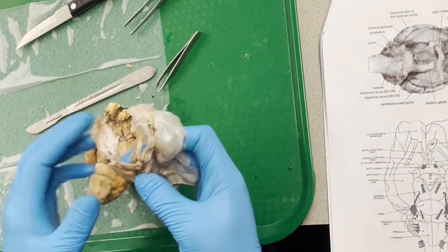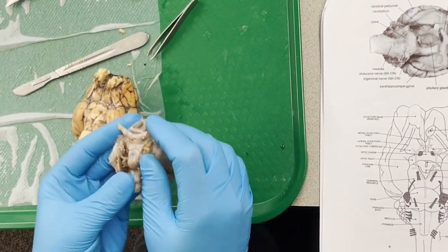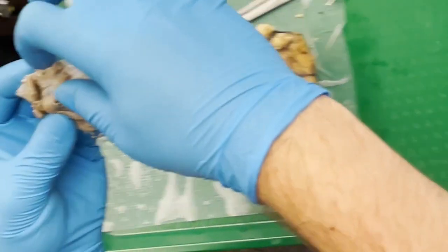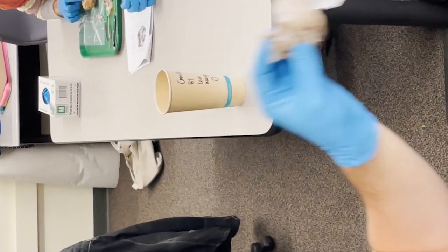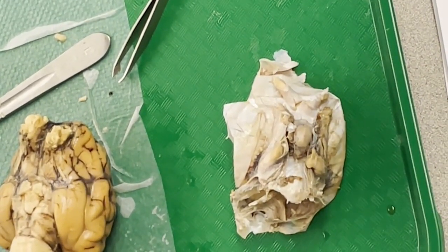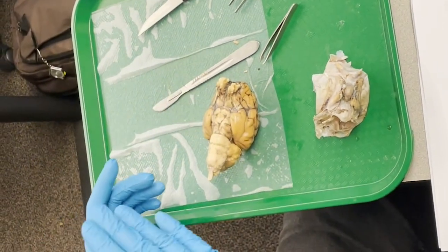You can see this on your dura mater if you take a look back at it. And the optic nerves are sticking out as per prongs like this. So it kind of makes a little bit of a V shape on the outside. The crossover, where it's the bottom of the V, that would be the optic chiasm. And then as these same nerve tissues recede into the brain, deep into structures like the thalamus, they're called the optic tract. So it's nerve, chiasm, tract.